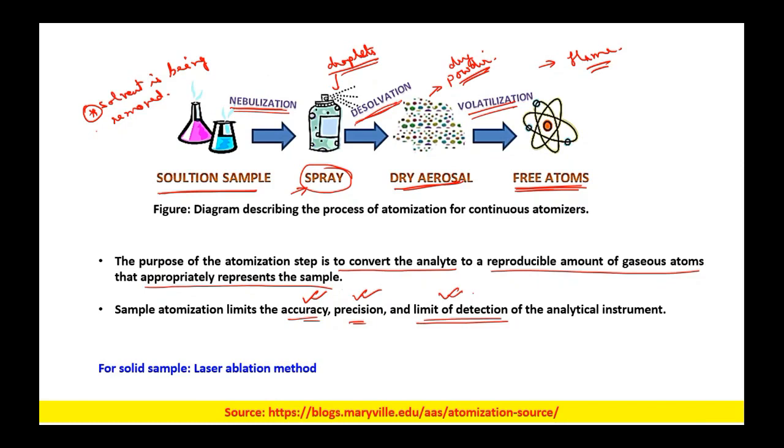So the steps I have told you here require that the sample has to be in solution form. So what happens if you have a sample which is in solid form? For solid form, we have the laser ablation method.